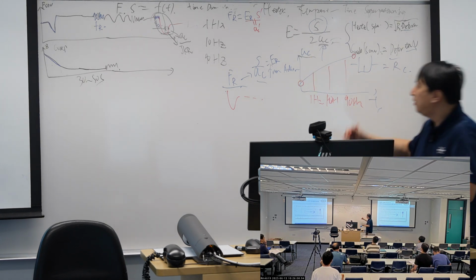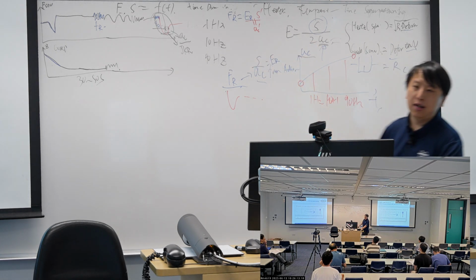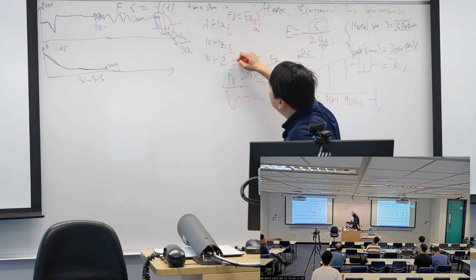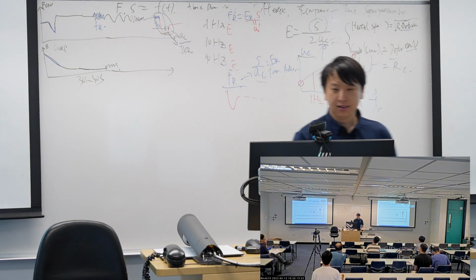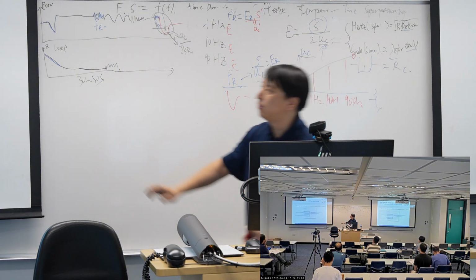And then every time you have an AC, every time you have a stiffness measured by AFM, you can get the modulus correctly. That's our idea of setting the reference frequencies.